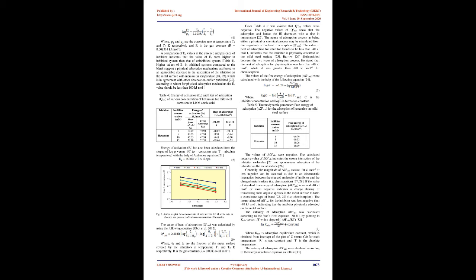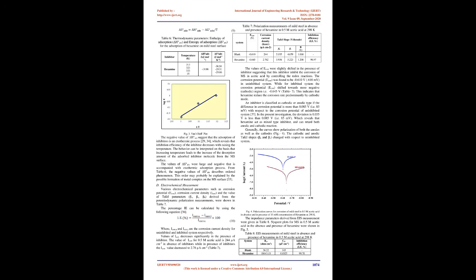Electrochemical measurements. To study the mechanism of inhibition action and efficiency of hexamine on MS in acetic acid solution, polarization study and electrochemical impedance spectroscopy, EIS, measurements were carried out without and with 15 mM of inhibitor concentration. The volume of 0.5 M acetic acid as corrosive medium was kept at 200 ml. The test specimen having an area of 1 square centimeter was immersed in the corrosive environment to act as working electrode. A platinum electrode was used as auxiliary electrode and a saturated calomel electrode, SCE, as reference electrode. All the experiments were carried out at a constant temperature of 298 K.